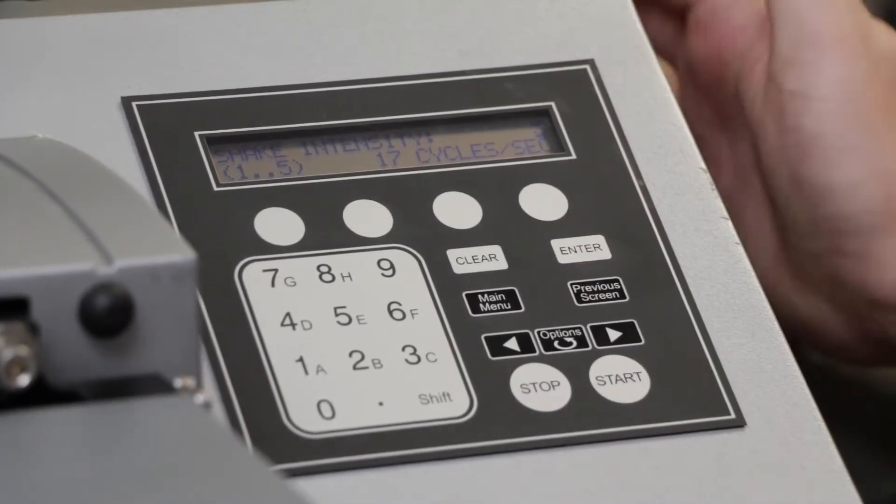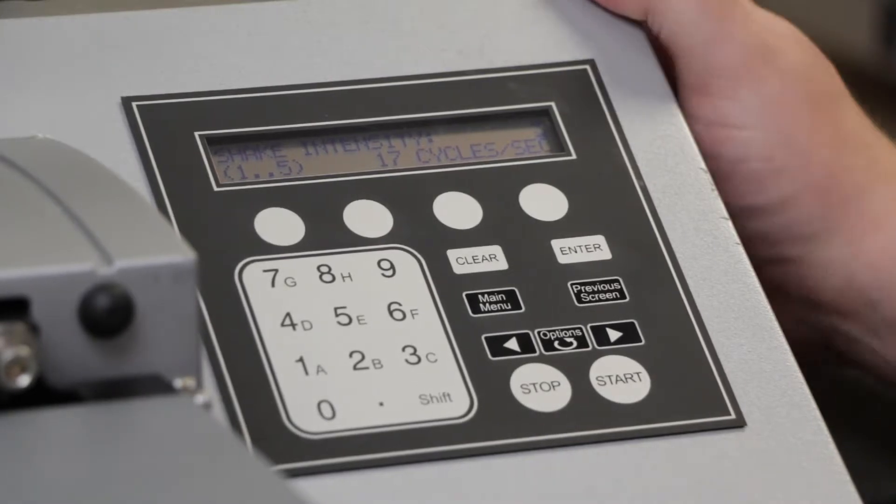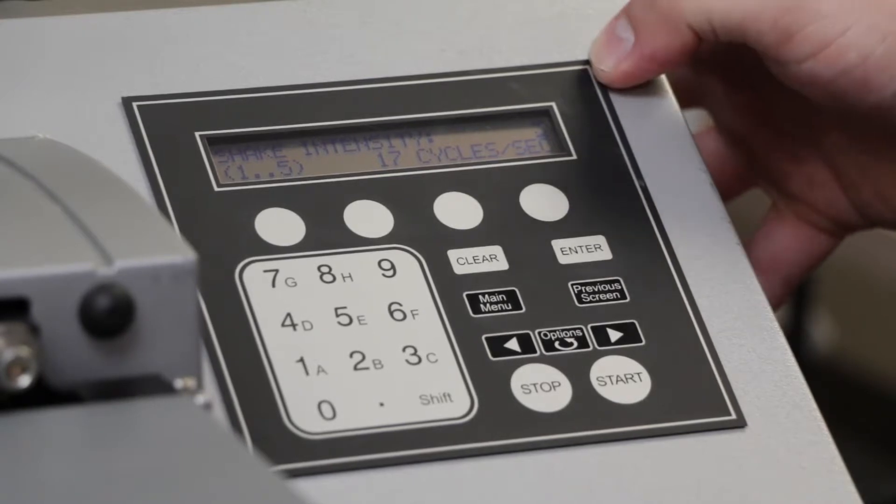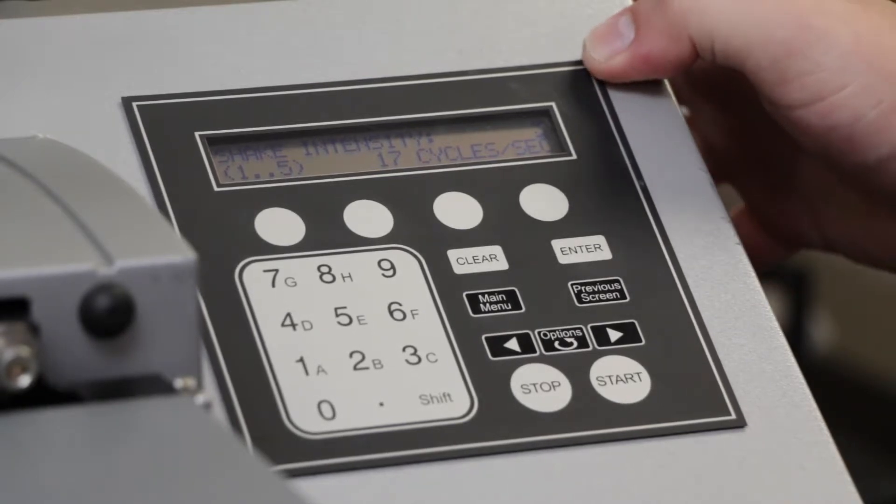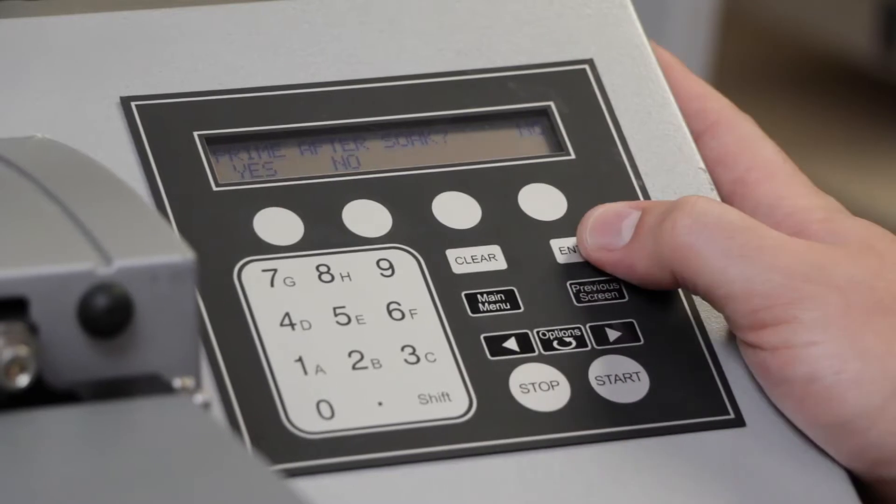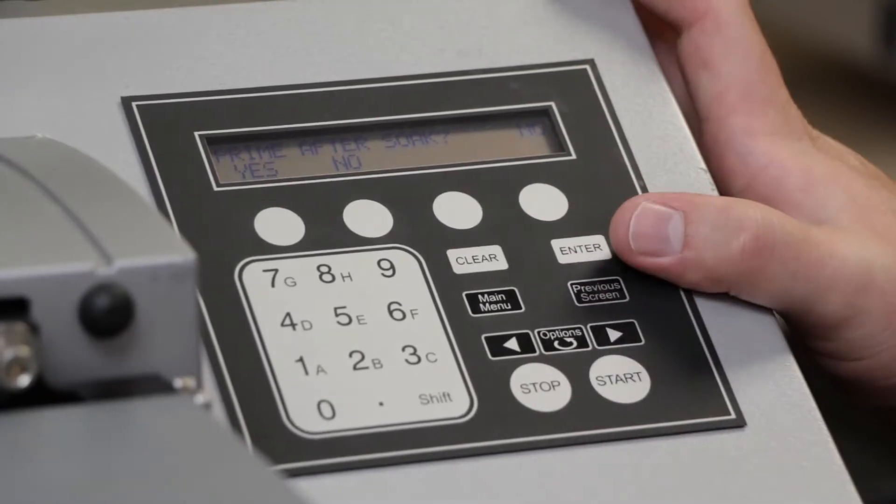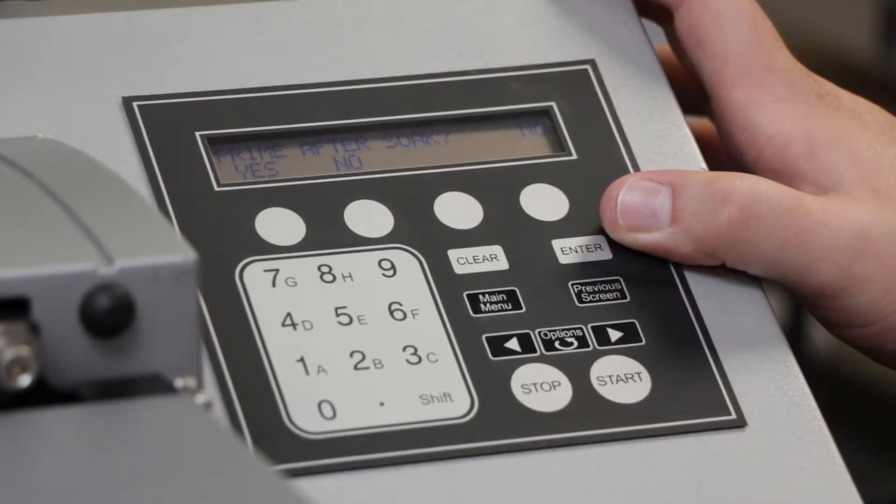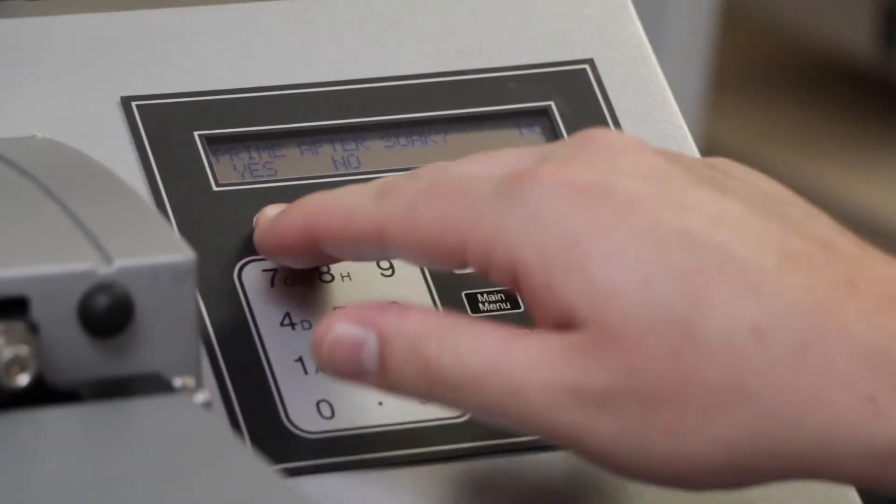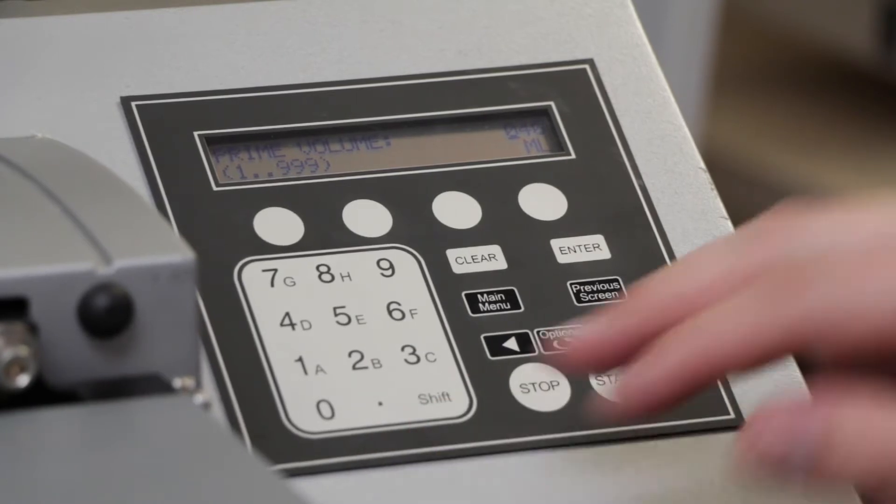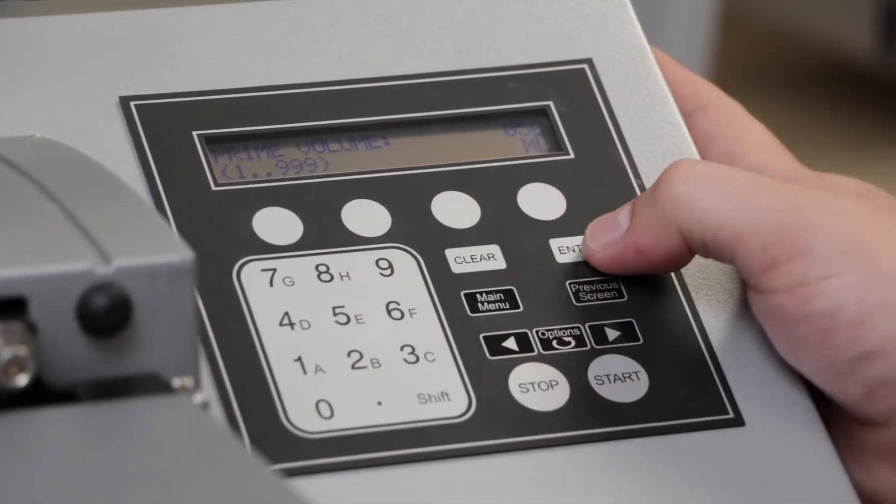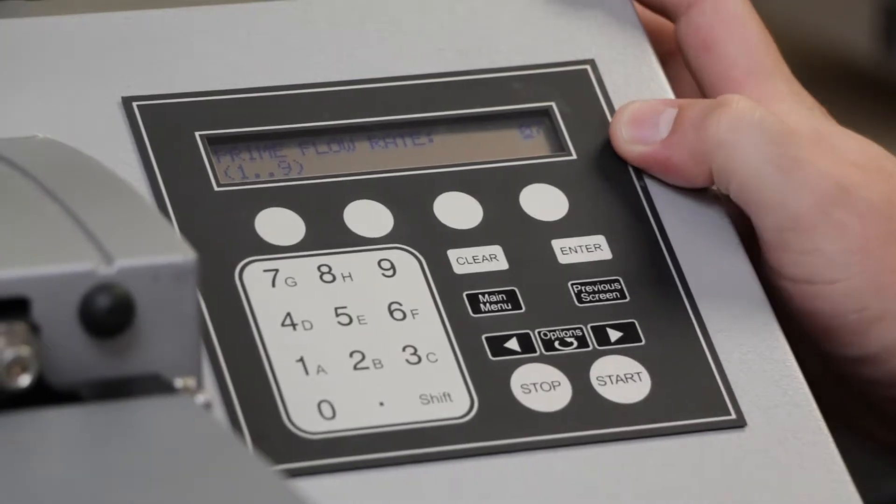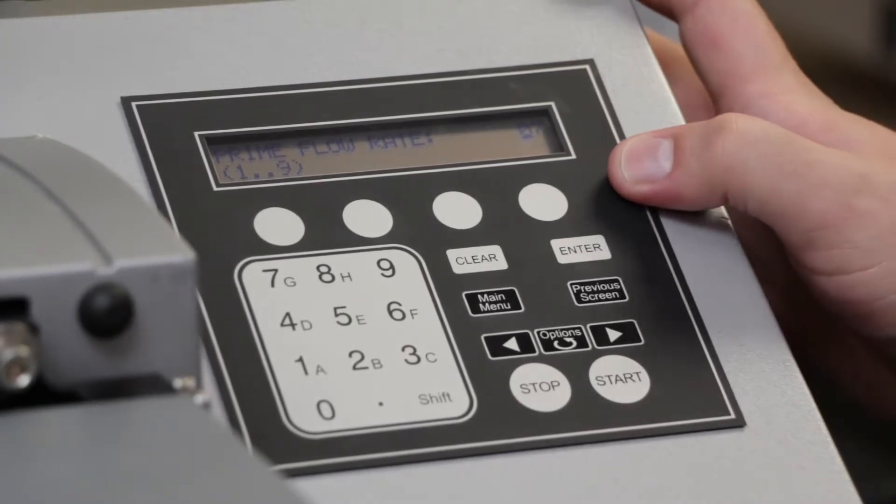Shake intensity is self-explanatory. How intense of a shake do we want? I recommend keeping it in the middle, the default at three, as higher volumes and intensities have the potential for spillage. Priming after a soak is useful for if you want to make sure that you've got plenty of fluid within the pumps and the manifold itself. So we'll select Yes, and we'll add, say, a 50 milliliter prime. You'll also be prompted with a prime flow rate, and this can be left at the default value.